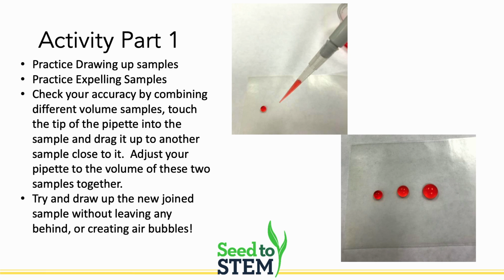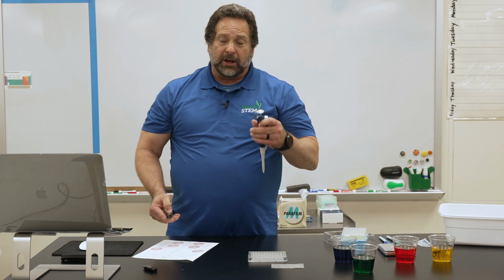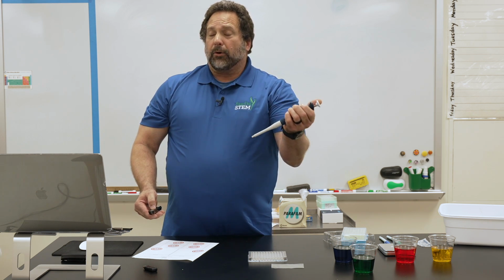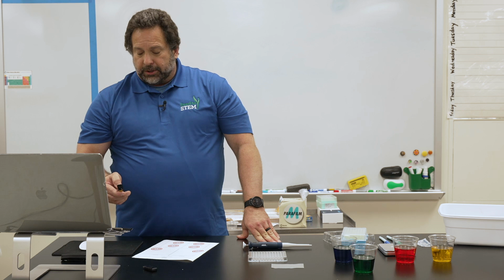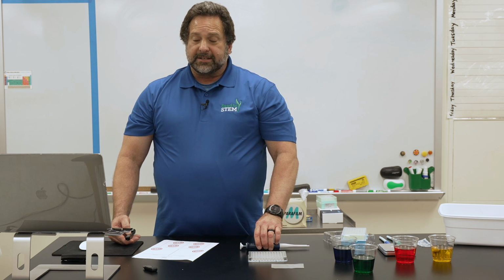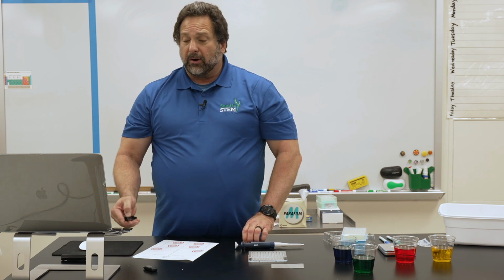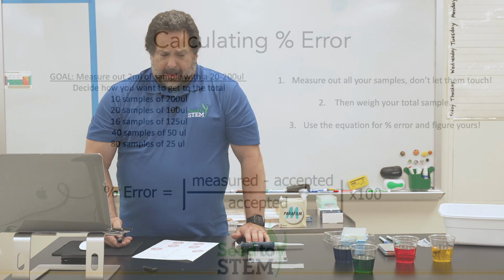Now, that's a lot of practice. So the whole purpose here is practicing with this so you feel comfortable using it. You know which arm or which hand you can use. It makes it feel more natural for you to use, okay? At that point in time, you're going to try to pull those drops together and see if you can pull that all the way back up with the new volume and see if that works, okay?